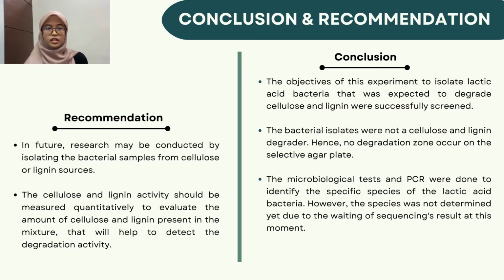In conclusion, the objective of this experiment to isolate lactic acid bacteria that were expected to degrade cellulose and lignin was successfully achieved. The bacterial isolates were not cellulose and lignin degraders, hence no degradation zone occurs on the selective agar plate. The microbiological tests and PCR were done to identify the specific species of the lactic acid bacteria. However, the species was not determined yet due to waiting for the sequencing result at this moment.